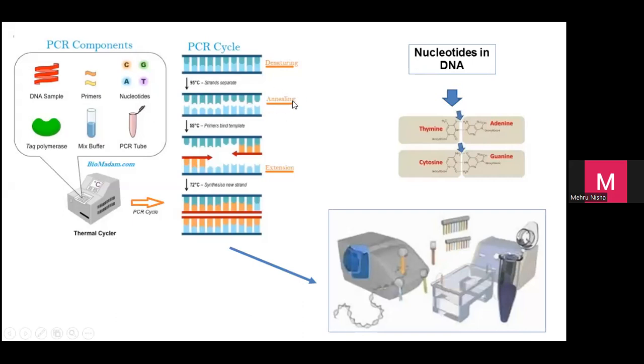Now we have annealing. Annealing bermaksud suhu yang the primers will come and bind. Primers ialah yang initiate DNA line.